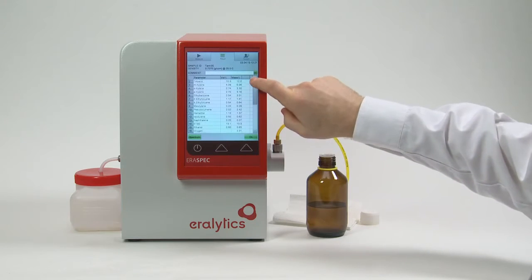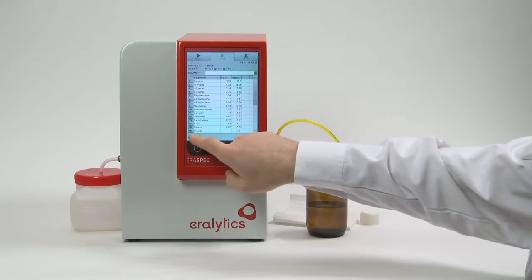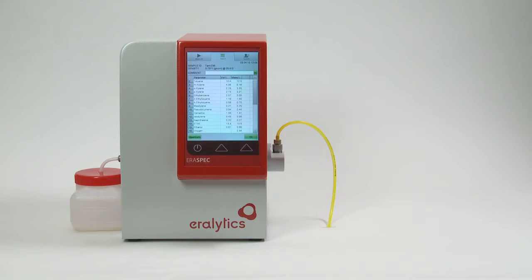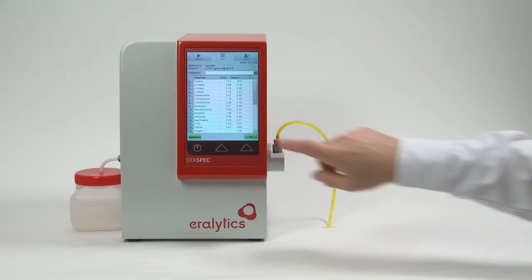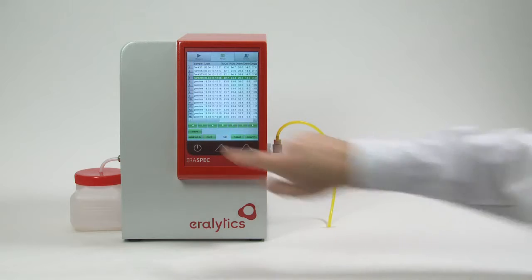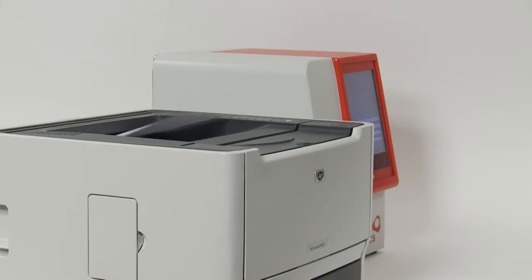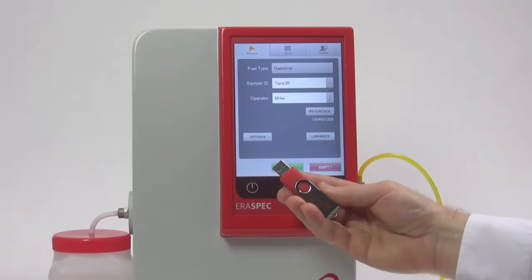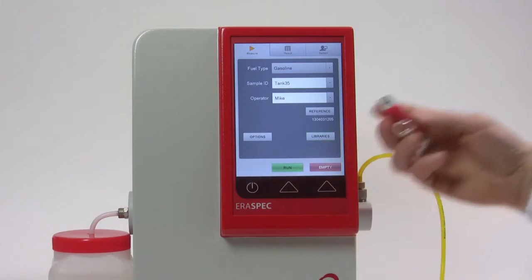To view the absorption spectrum of that sample, press Spectrum. It is also possible to load other spectra from the results for fast and easy comparison and analysis. The data can also be printed on a directly connected printer or via Ethernet connection to a LAN or network printer.